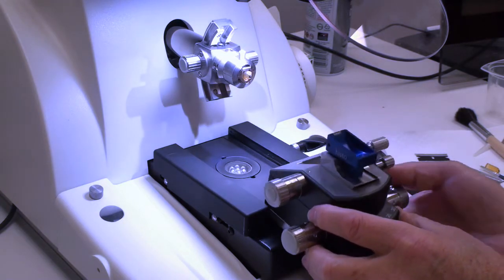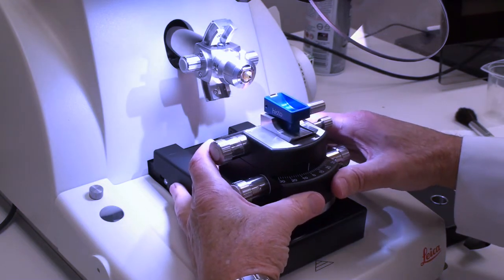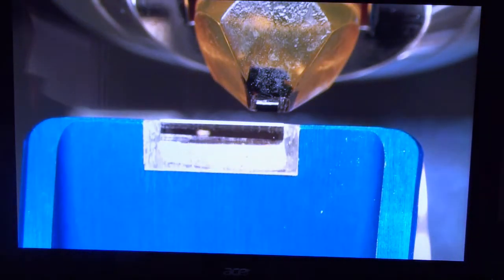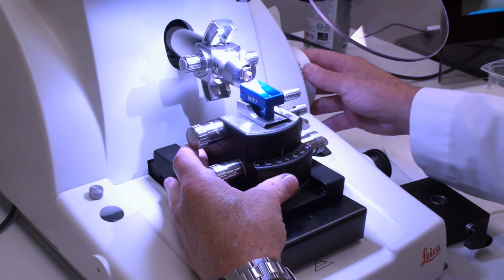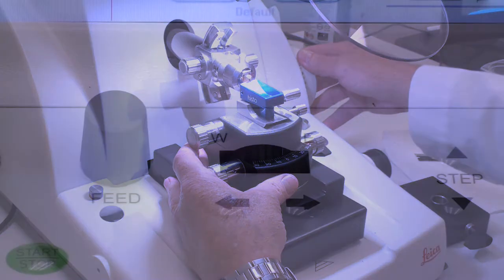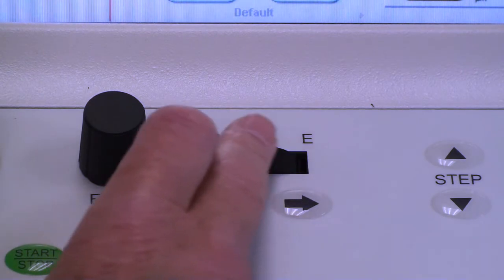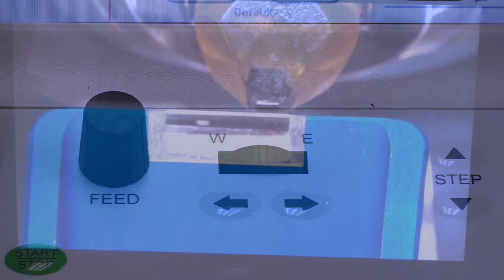As we put the knife holder in, we're going to slide that forward. And I always use fingers in the front so that you don't accidentally move it too quickly. And looking through the binoculars, you want to make sure that your sample is relatively close. But you don't want to be a hero. You don't want to move it too close. And it's important to have the specimen at a good height so you can actually see where the sample is. Often you want to use a different area of the knife in terms of its length.